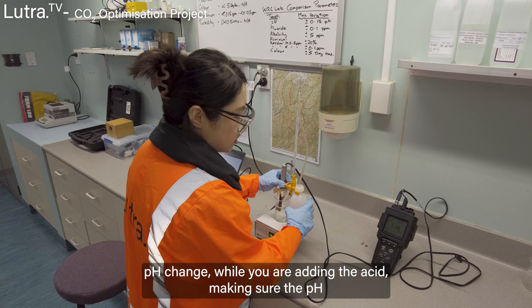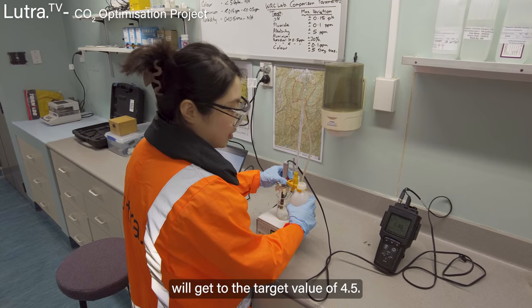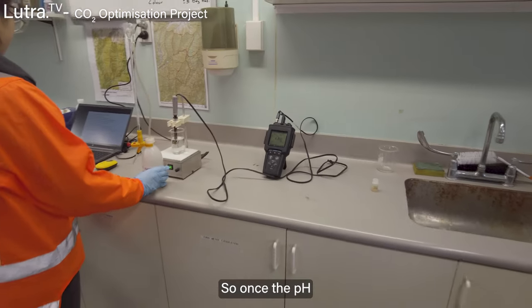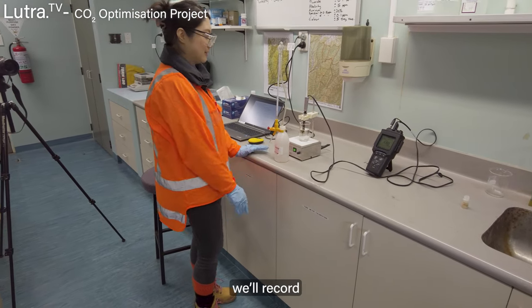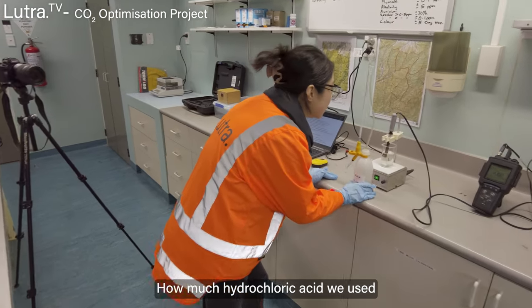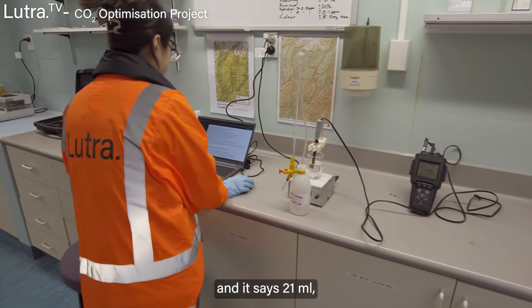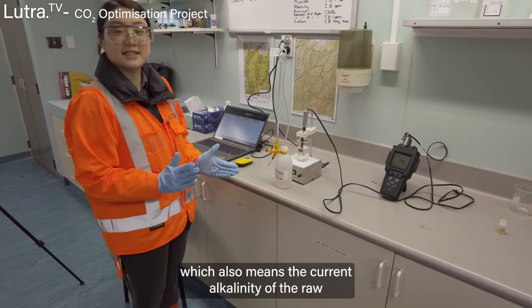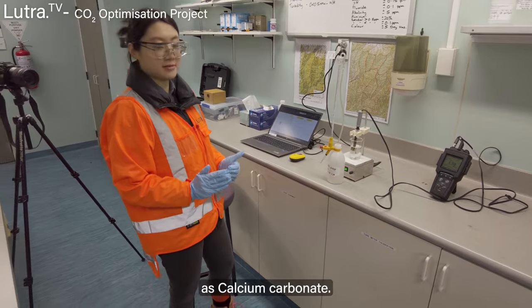Also monitoring the pH change while adding the acid, making sure the pH gets to the target value of 4.5. Once the pH reaches 4.5, we record how much hydrochloric acid we used — it reads 21 ml. This also means the current alkalinity of the raw water is 21 mg per liter as calcium carbonate.